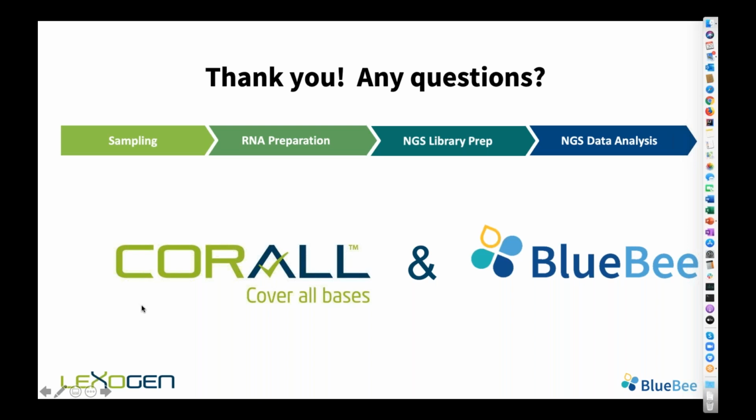In terms of replicates, we recommend, I would say, around 3 to 4 replicates to have a really reliable outcome. What also helps for a reliable outcome are spike-in controls that you might also want to consider. We have the SIRV RNA spike-in controls to spike into your RNA before extraction and library prep. That will also help you to assess the quality of your data.